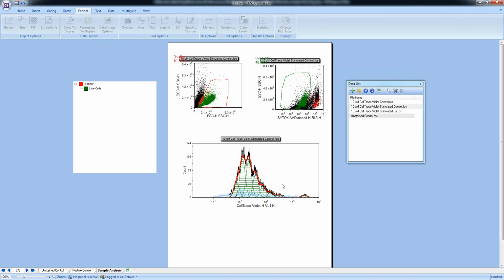And what I'm going to show you now is how to actually adjust some of the fit parameters in the proliferation analysis module to make the proliferation analysis fit your data more accordingly. And again, this is because not all biological samples follow the mathematical model exactly. Anybody who's done any kind of biology probably knows that, and you do have to make some minor adjustments sometimes to make the data fit a little bit better.